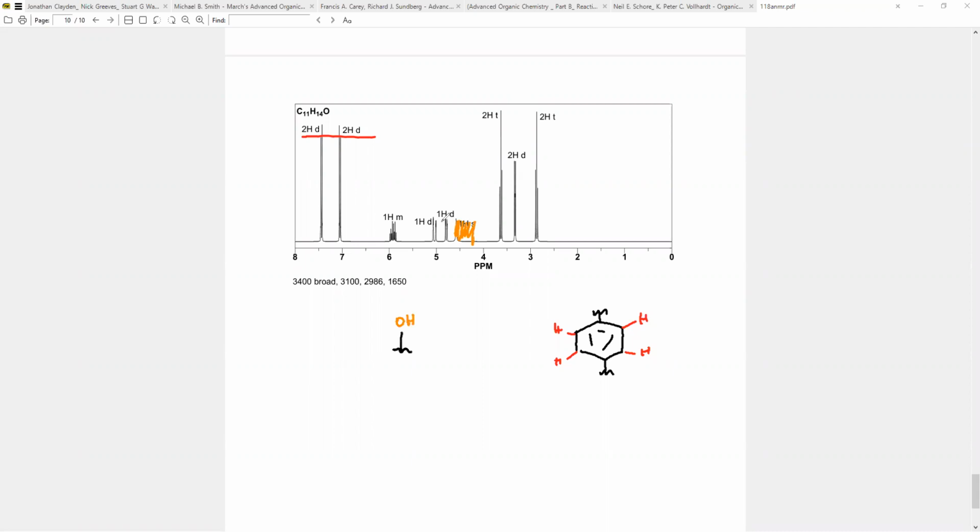But if I look here, I have a 1H and a multiplet. We talked about this: these 1Hs are very close to each other. They're just splitting because they're diastereotopic. So we have an alkene with a CH2 at the end, and then we have this multiplet. Whenever we have 3 hydrogens in this region, this is going to be a terminal alkene. Okay, a terminal alkene. Now, another little trick: I can literally tell which H is which. This, this, and this.